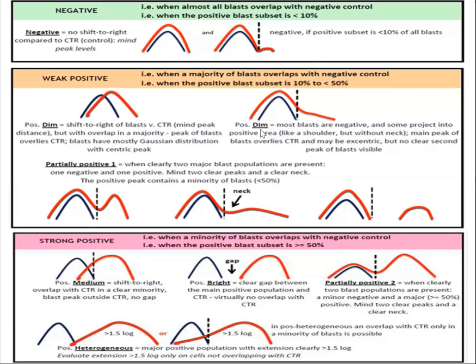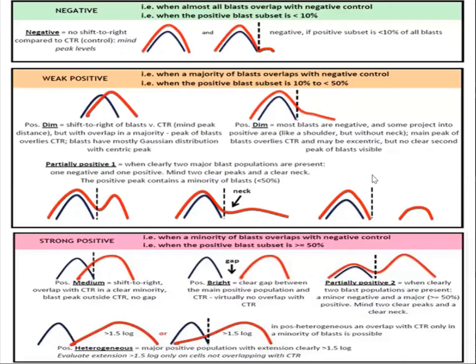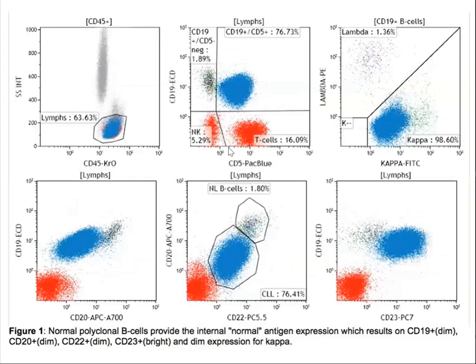So this is the much easier and more reliable, reproducible method of expressing the markers, because in leukemia lymphoma you cannot draw histograms for each marker with negative control. You can't do this, or you will do reporting for 2-3 hours for one case. Now I've spoken much. Now you need to speak. I'll tell you the population, you tell me what it is like.